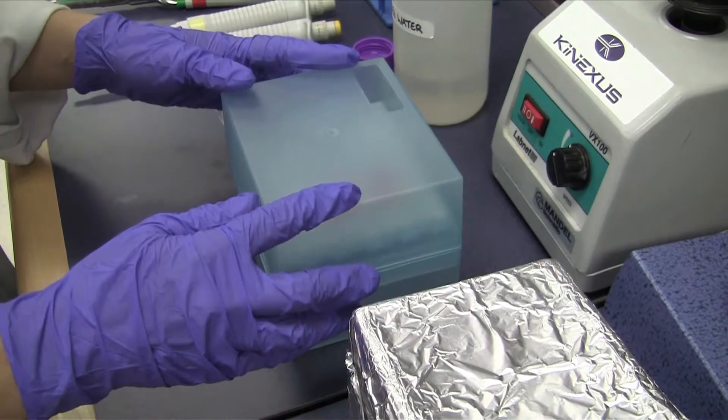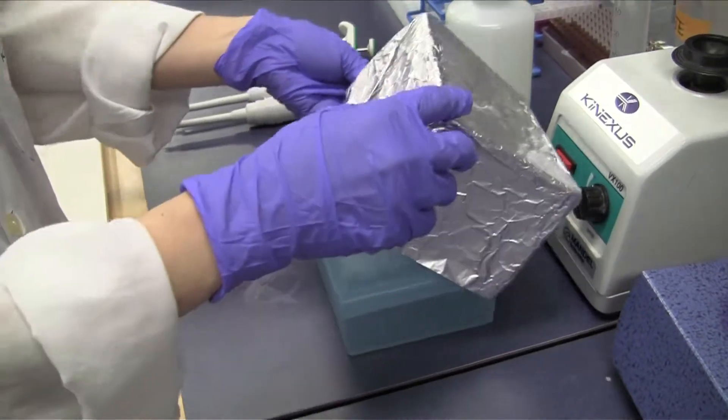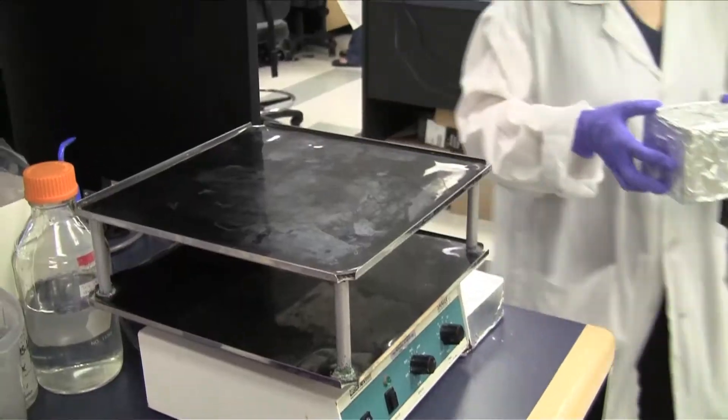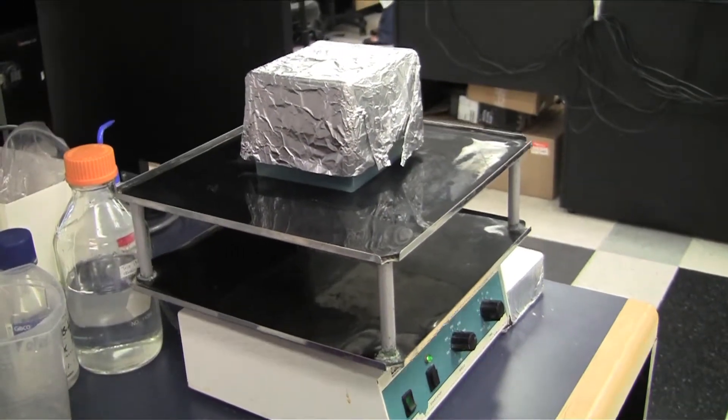Place the microarray in a humidity chamber and keep in the dark. Place the humidity chamber with the microarray on the shaker for two hours at room temperature.